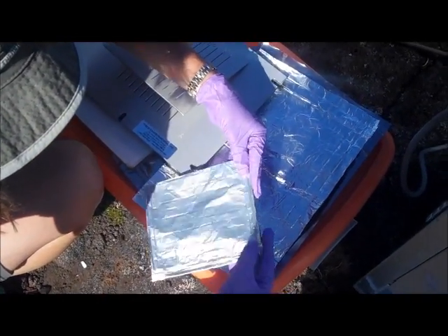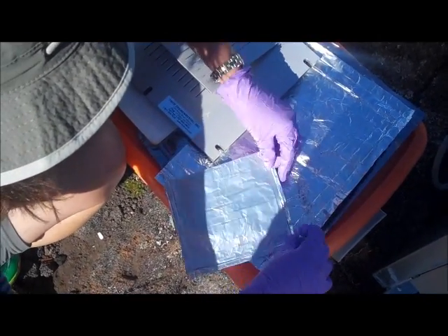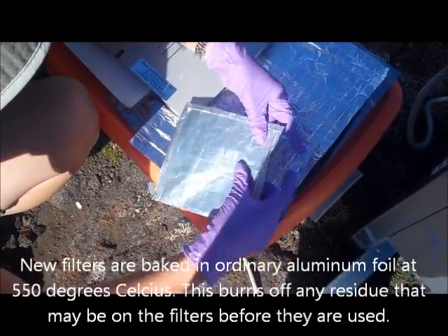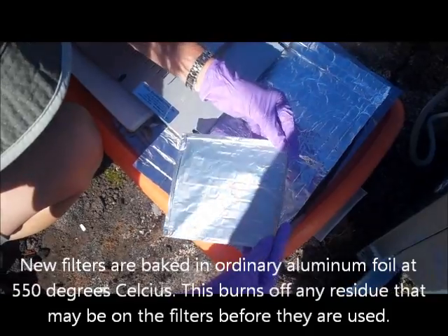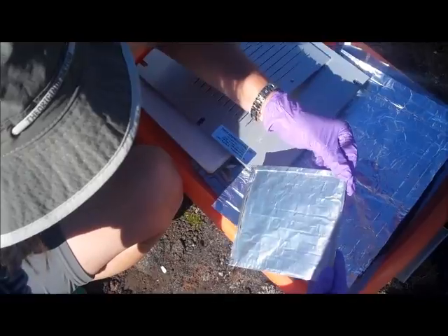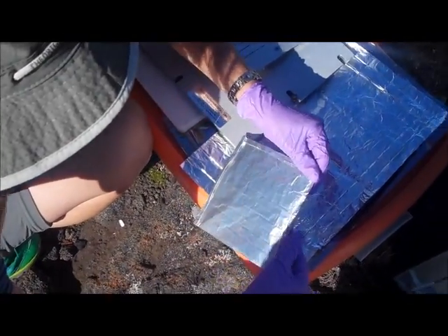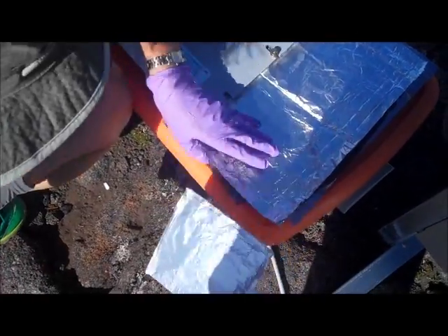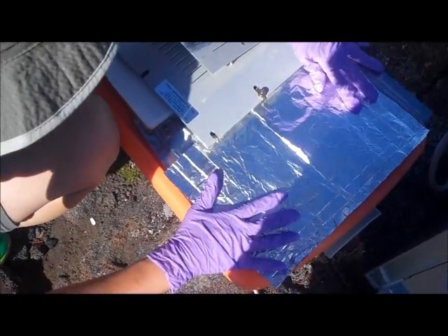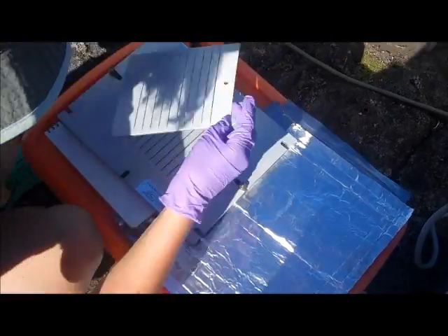I wrap this filter back in the foil as nicely as I can. It's a little tricky — the gloves stick to the foil, so it's hard to make it neat. Alright, that one's set. I'll put it underneath, and now we'll see if the smaller particles also have color associated with them or not.